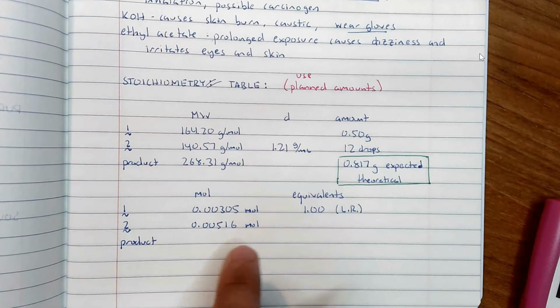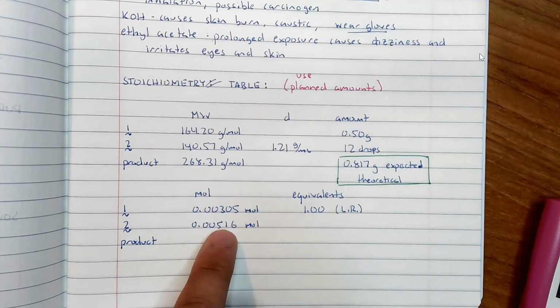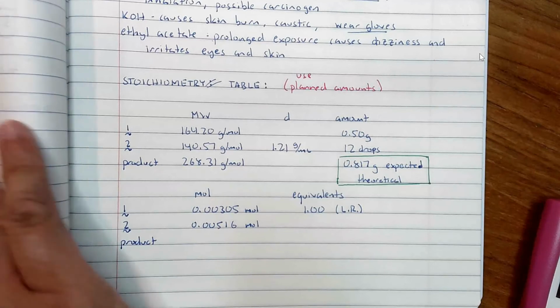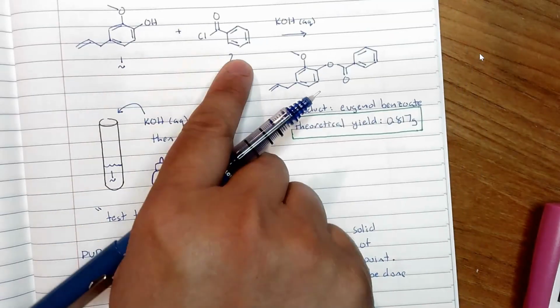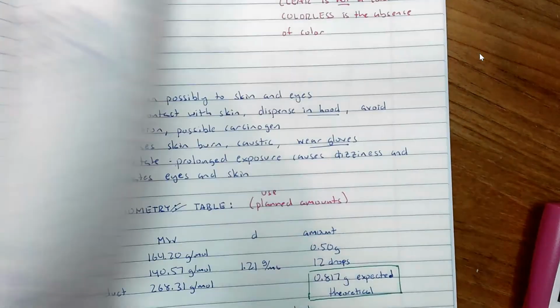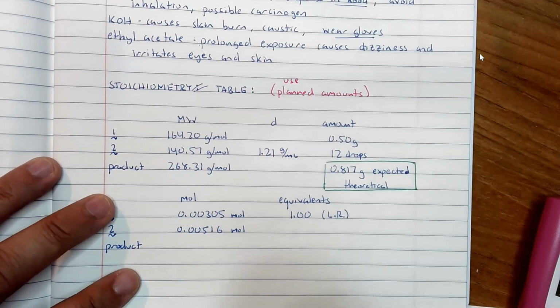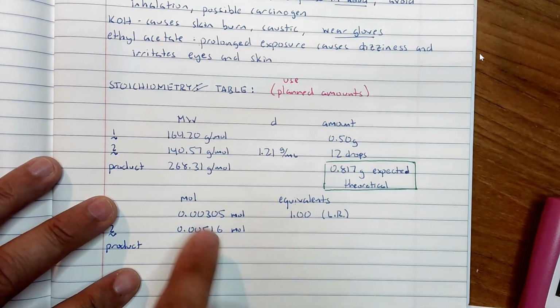So we would expect the equivalence to be larger than 1, because the amount of moles is larger. Now, that's not always going to be the case, because your ratio could be a 1-to-2, or 1-to-3. You have to do this on a case-by-case basis, but the trick is the equivalence is literally the mole ratio.